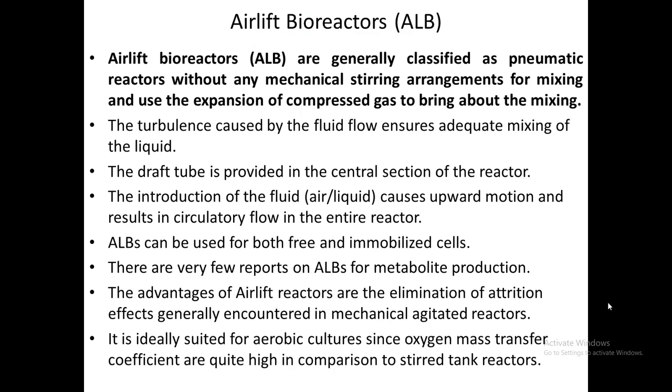Airlift bioreactors are generally classified as pneumatic reactors without any mechanical stirring arrangement for mixing, using the expansion of compressed gas to bring about the mixing. Turbulence caused by fluid flow ensures adequate mixing of the liquid. The draft tube is provided in the central section of the reactor. The introduction of the air-liquid fluid causes upward motion and results in circulatory flow in the entire reactor.